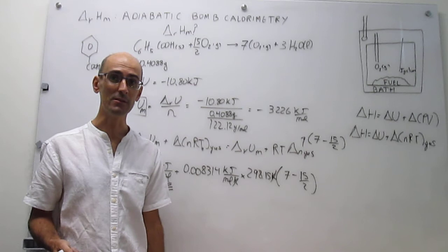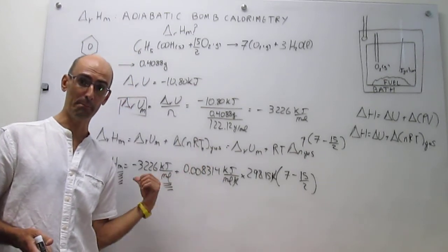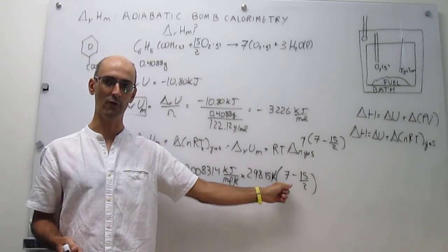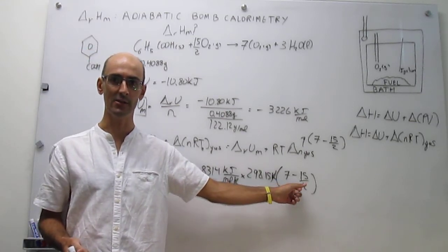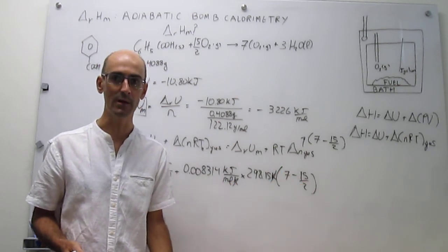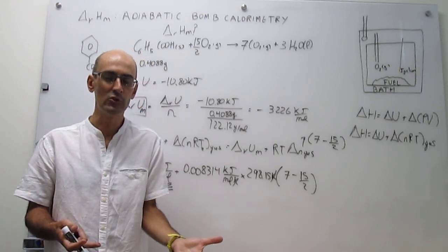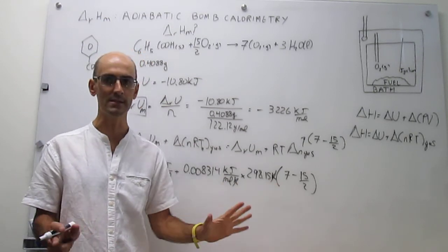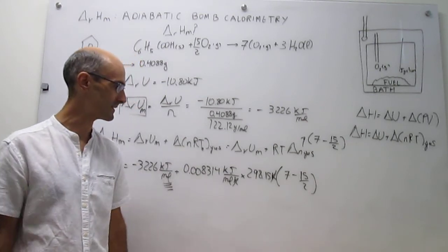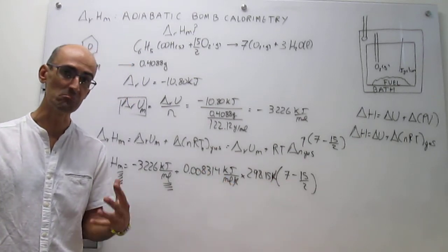This is simply telling you that if you were to run this with 1 mole, so per mole, you will be generating 7 moles of gas products, and you would be consuming 15 halves of moles in reagents, right? But because you're dividing this per mole, those units disappear, and this is simply the balance of the stoichiometric coefficients. Okay, so that's kind of the last sticky point in this whole discussion.